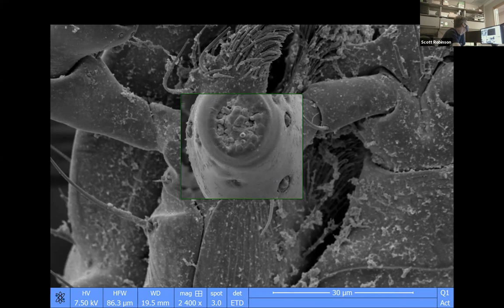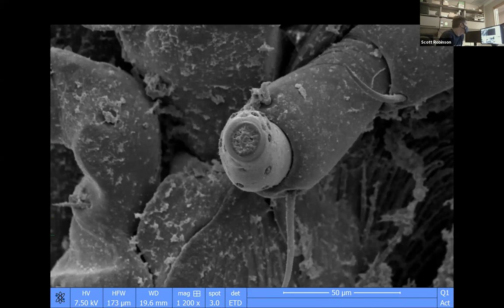And so this is a scanning electron microscope. Although you don't see it, the electron beam is constantly rastering, constantly going across. It's the same way that you look at a TV. An electron microscope is actually like what TVs used to be called, cathode ray tubes. Now they're not the same because we have LED TVs, but an electron microscope is like an old version of a TV.